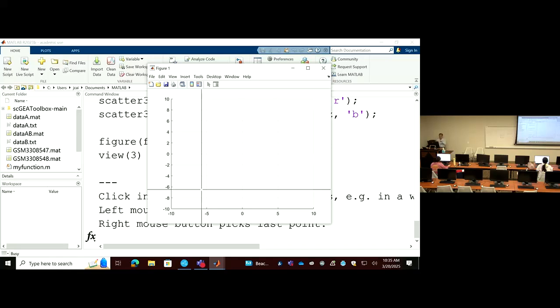This piece of code will bring up an empty window like this, and you are ready to use your mouse. Left click to create points. So I show you how to do it before you do. So use your click and start to click points. Just randomly make a circle. And once you get enough red points, then you click once with the other button of the mouse.